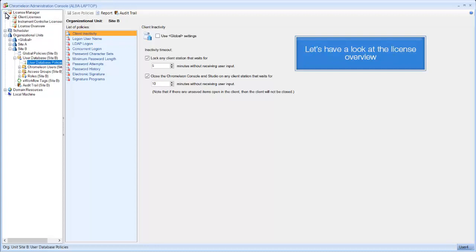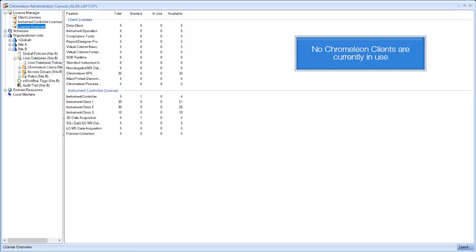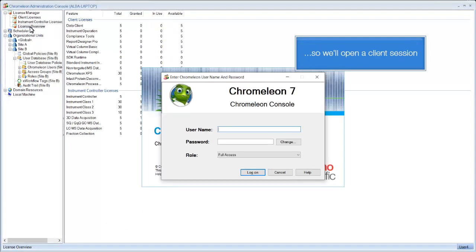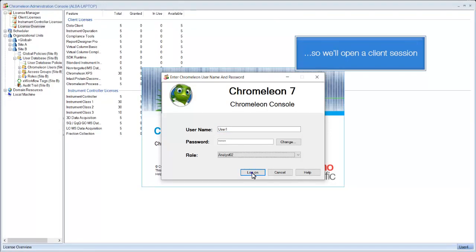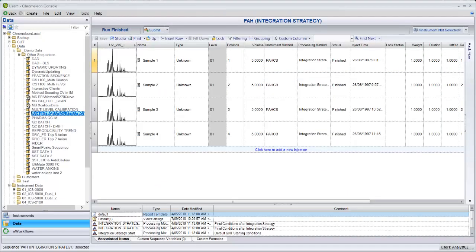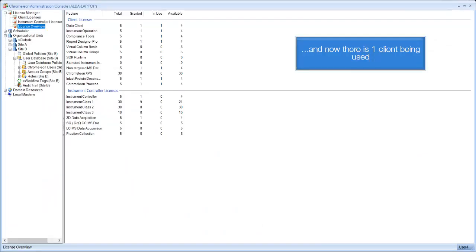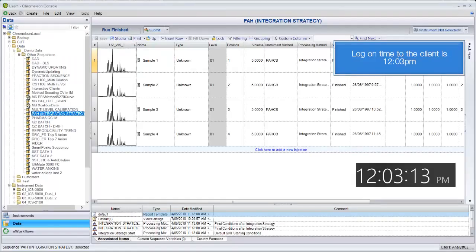Let's have a look at the license overview. No Chromeleon clients are currently in use, so we'll open a client session. And now we can see there is one client being used. Take note of the logon time.